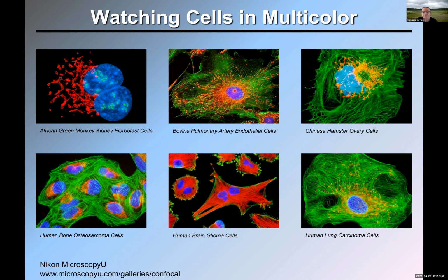And by imaging them at the same time, we can see how these targets are positioned relative to each other in the sample. And as I will show you later, not only is it possible to image structures and gain information on the structural features of cells, but it is also possible to monitor dynamic events. So you can acquire images sequentially. Essentially, you can record a movie and you can watch the different targets move relative to each other. I will show you one example in a moment.